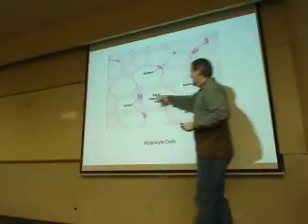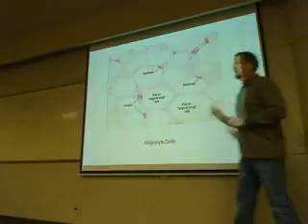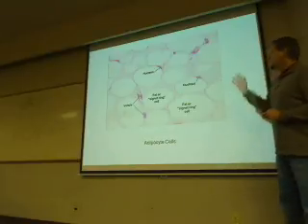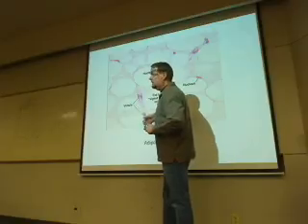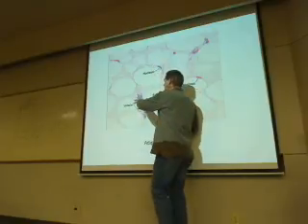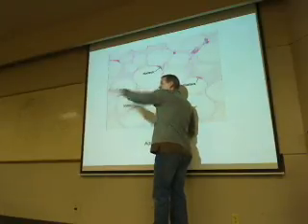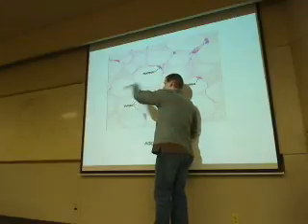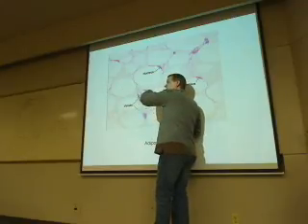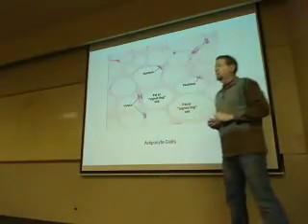So these are little tiny guys, like capillaries, that take the blood away. In this particular case, when they did the slides, they had to cut through venules. So they're helping with feeding in this case. These guys are taking the blood away, moving the waste products and CO2 out of the tissue, because the arteries, arterioles, and the capillaries brought it to the tissues. That's how that works.